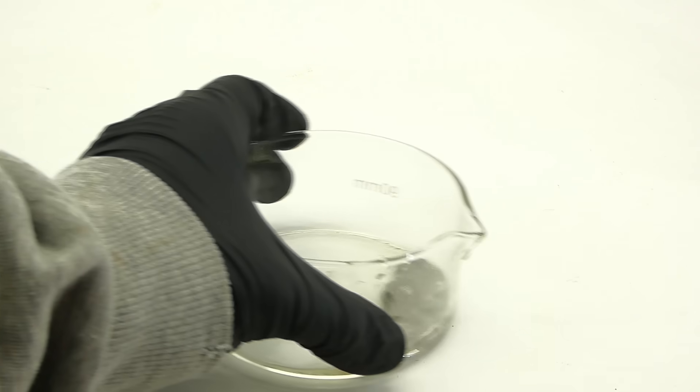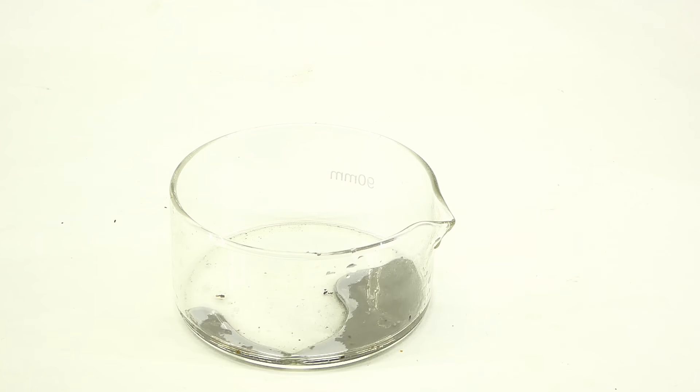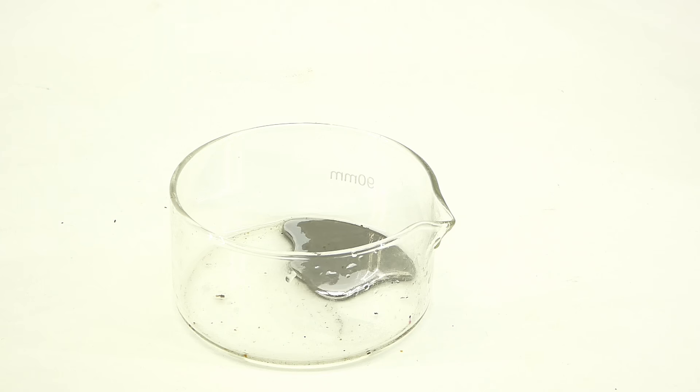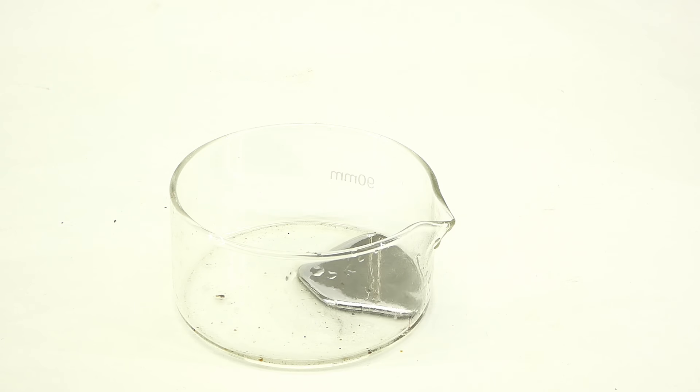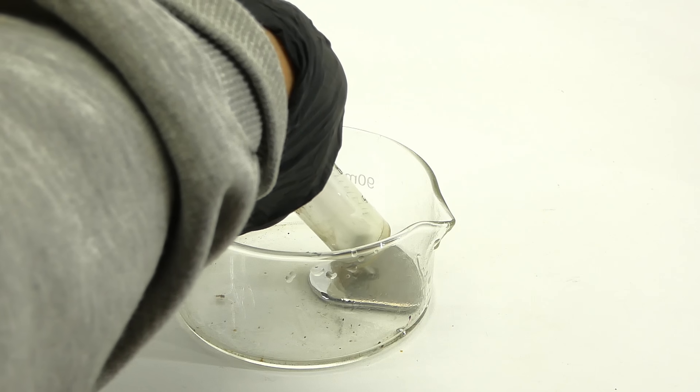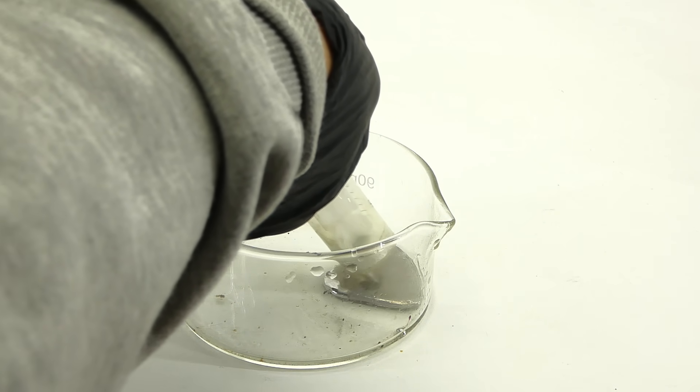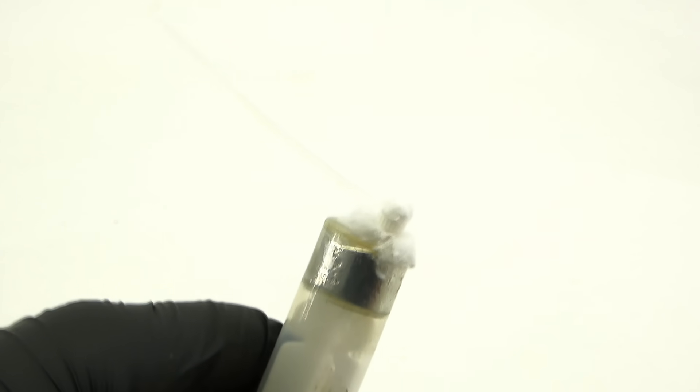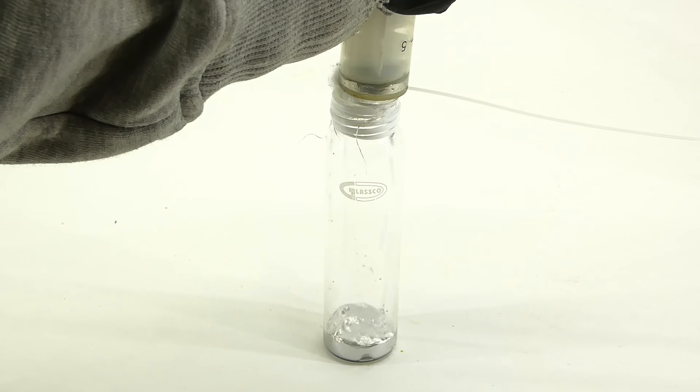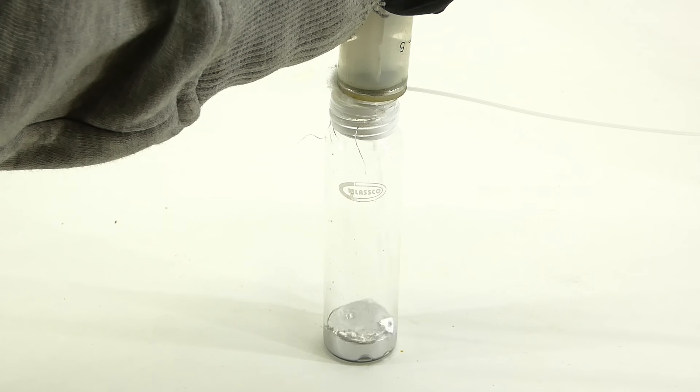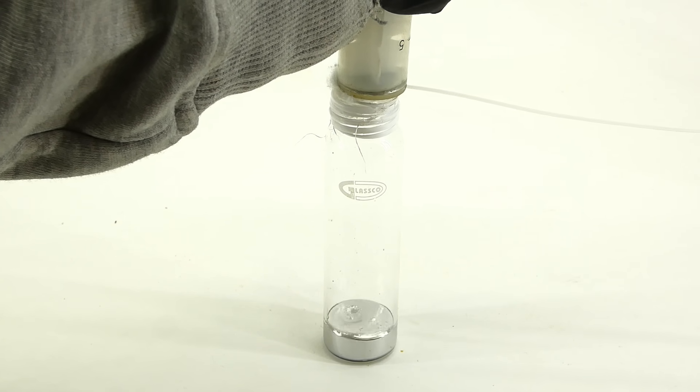After the washings, the mercury looked much better than before. It still had some junk floating on it, which I wanted to remove. To do that, I sucked everything into a syringe, made a makeshift cotton filter, and passed the mercury through it straight into a vial, which looked and sounded really satisfying.